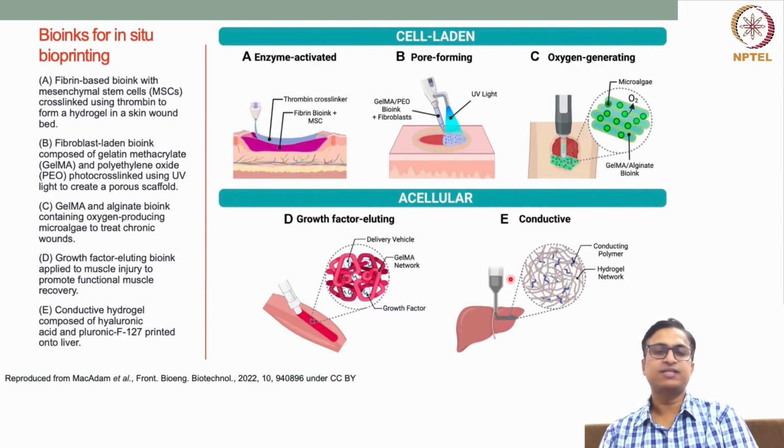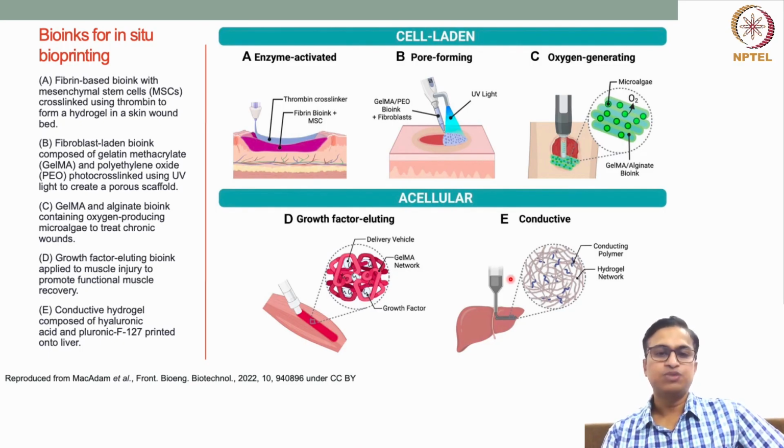So different strategies can be employed, and different types of bioinks can be used for in situ bioprinting. Please look for more and more examples in the literature. I will also discuss a few more examples in this lecture.